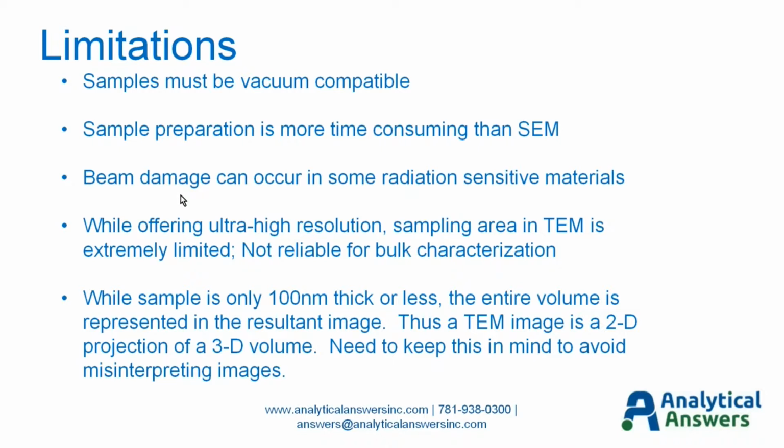We do have some advantage here though in that we're not forming a raster scanned image, so we don't need to finely focus that beam down on a spot, and we can actually demagnify the incident beam to create a lower current density while still maintaining resolution in our transmission image. It's an ultra high resolution technique.